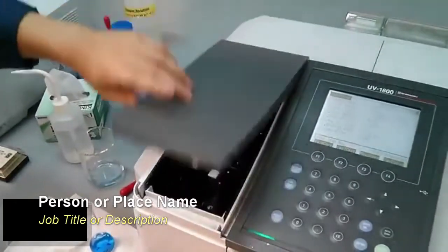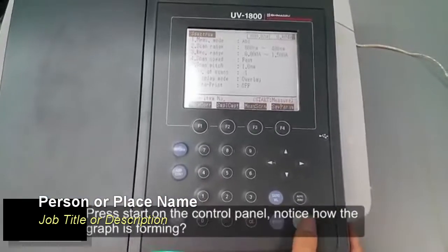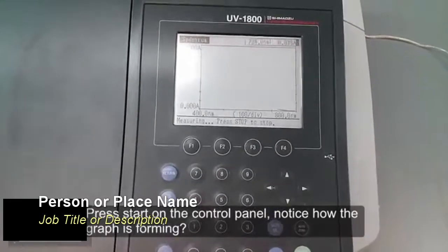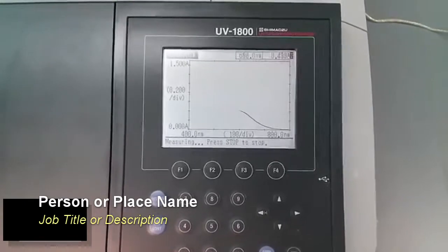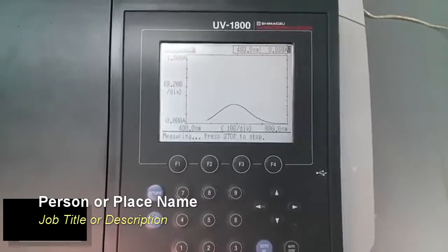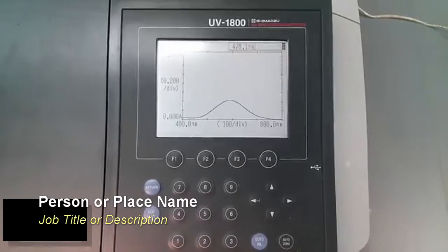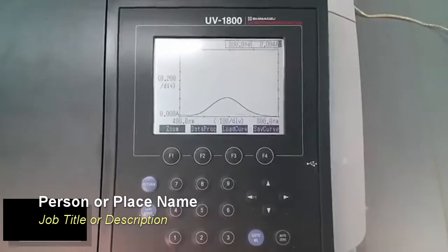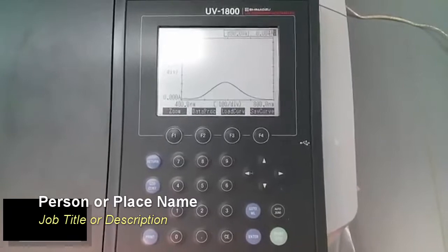Close the lid. Press Start on the control panel. Notice how the graph is forming, the line tracing from 800 nanometers to 400 nanometers. And we have a peak, the maximum absorbance at about 600 nanometers.